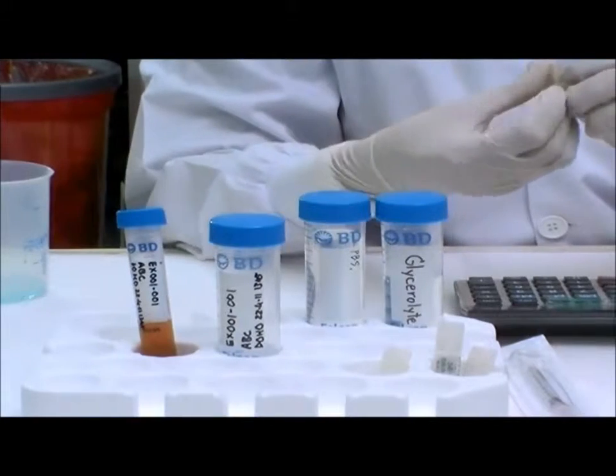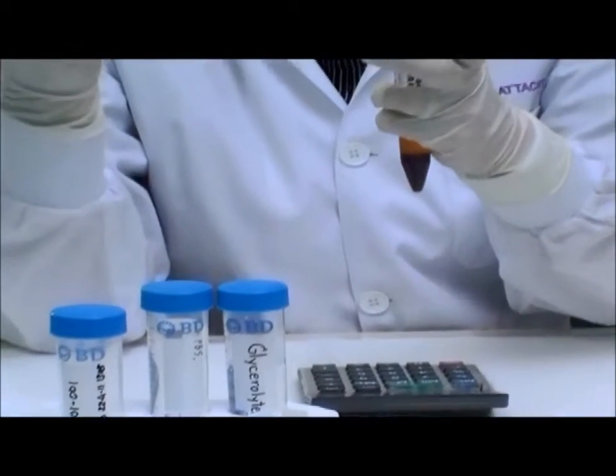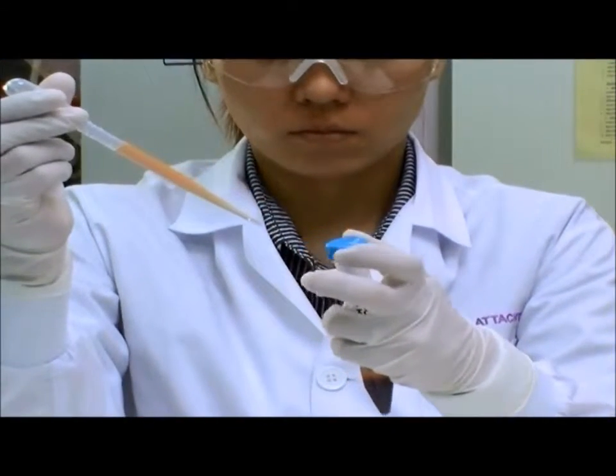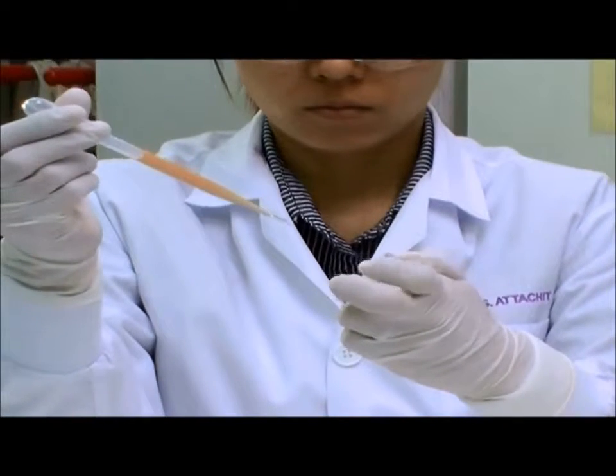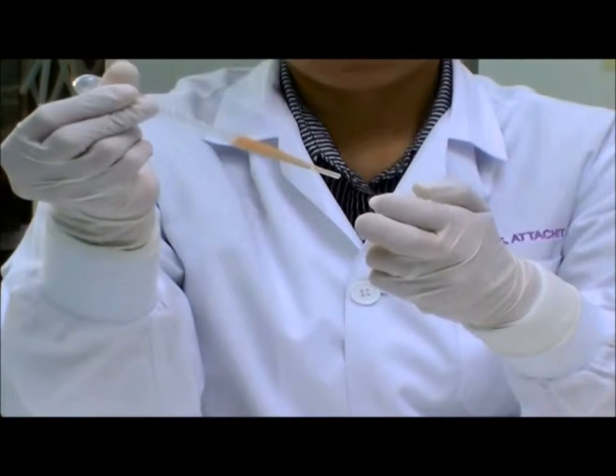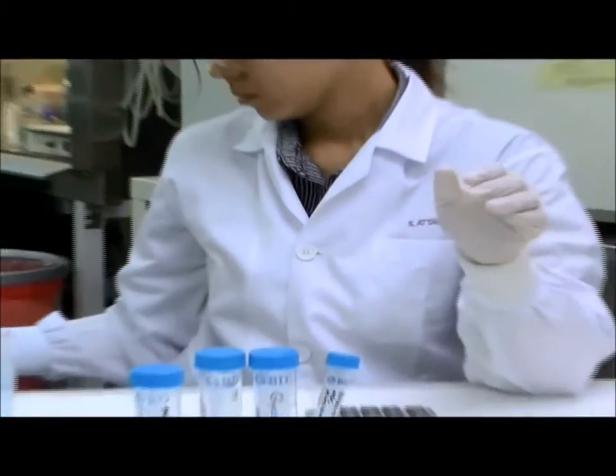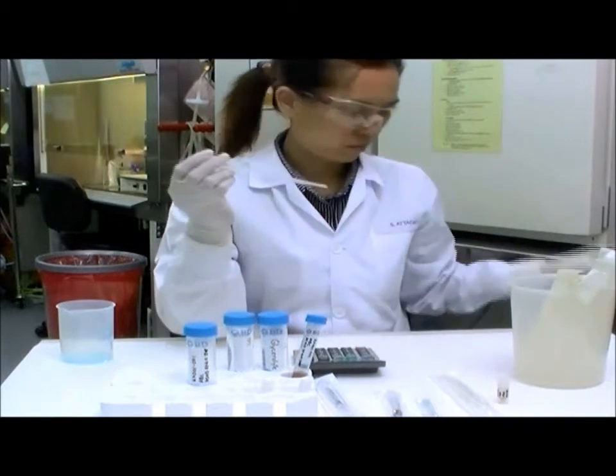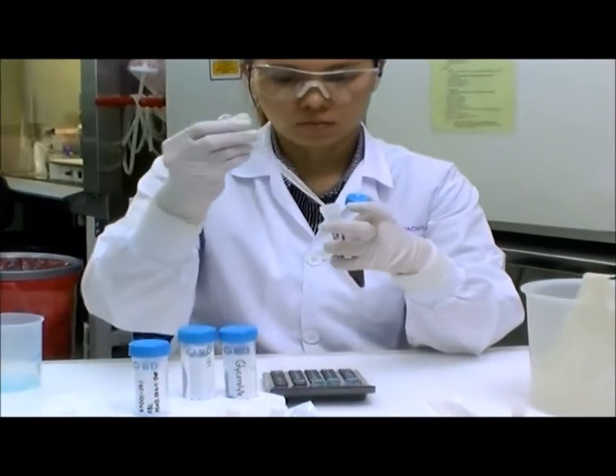After centrifugation, transfer approximately 1.5 ml of the plasma into a labeled cryovial and store in liquid nitrogen. Discard any remaining plasma along with the buffy coat.